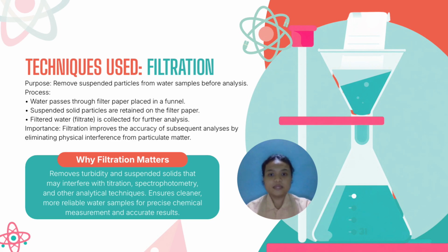Why does filtration matter? Well, filtration removes turbidity and suspended solids that may interfere with titration, spectrophotometry, and other analytical techniques. Other than that, it also ensures cleaner, more reliable water samples for precise chemical measurement and accurate results.